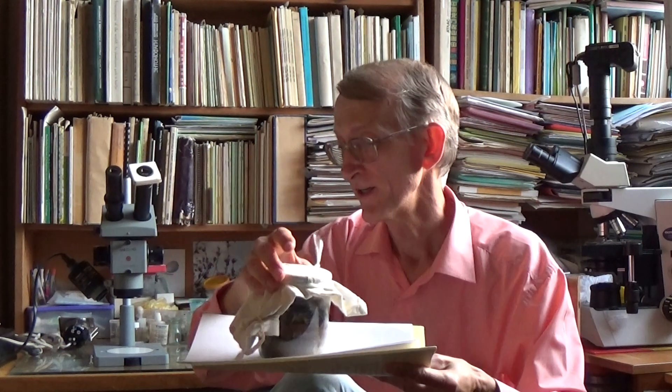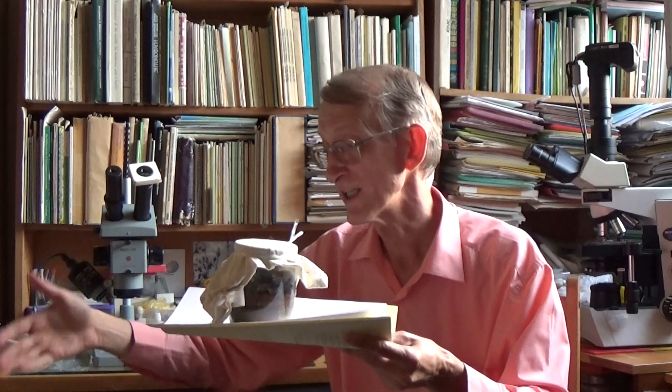I looked carefully and recognized that this is an acaroid — this is Acari, very tiny mites. This is class Arachnida, order Astigmata, family Acaridae. This is Acarus siro — the tiny flour mite.